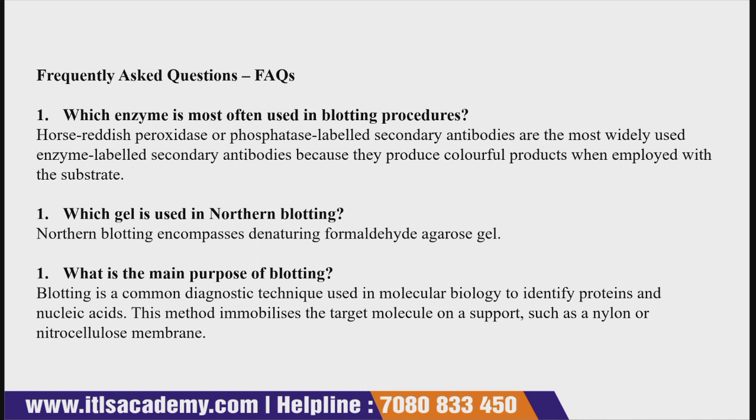Then comes which gel is used in northern blotting, meaning which type of gel. Northern blotting encompasses denaturing formaldehyde agarose gel. So agarose gel is used, that is a formaldehyde agarose gel is used as a gel in northern blotting.